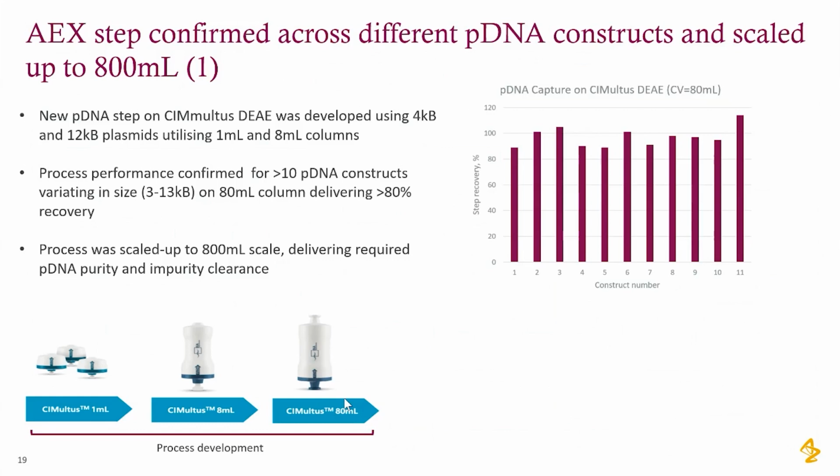And then we successfully transferred our process to an even higher scale, to 800 mL scale.